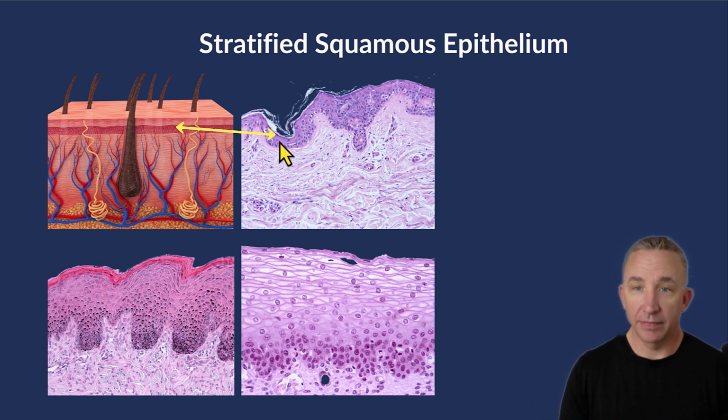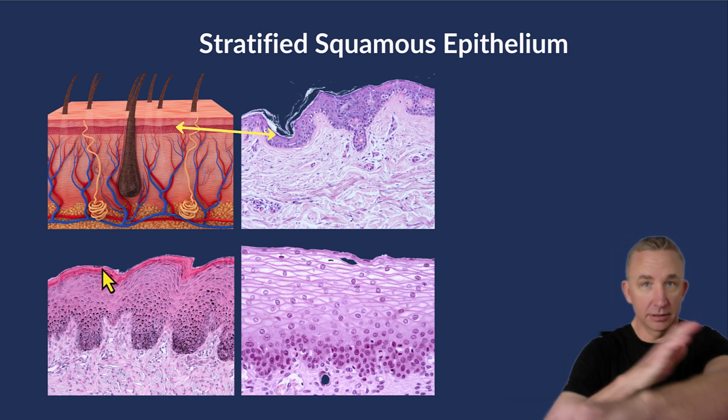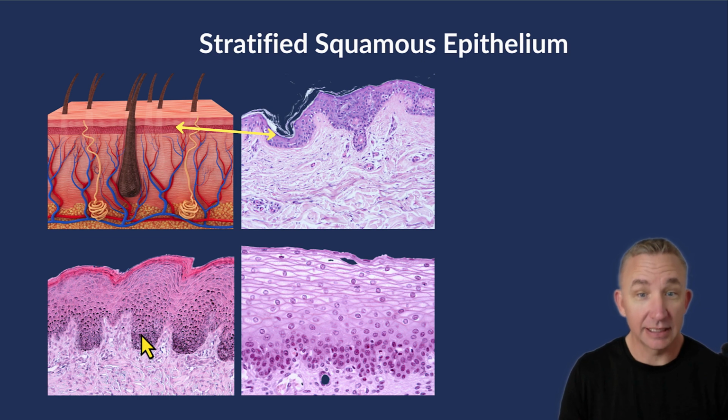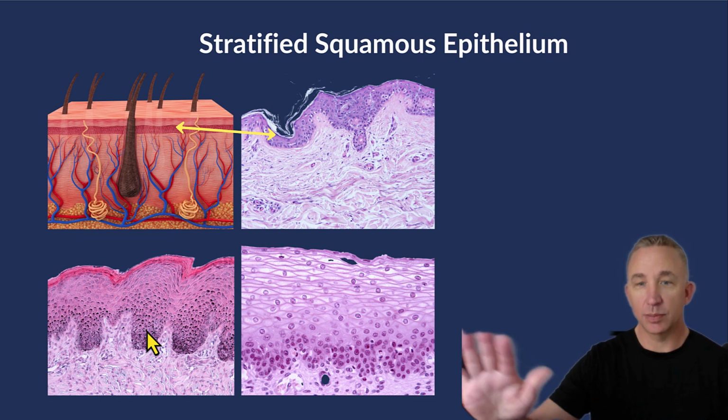So that ribbon, if I expand on it here, this is magnifying it from here up. This is my superficial layer of the skin, where I can touch its stratum corneum. And that's where you can see that it's literally a stacking of cells. I just go by the appearance and know my order. As this dark purple ends here, this is my basal surface, which means as I go up, this is my apical surface. So stratified squamous epithelium, that nice purple ribbon.